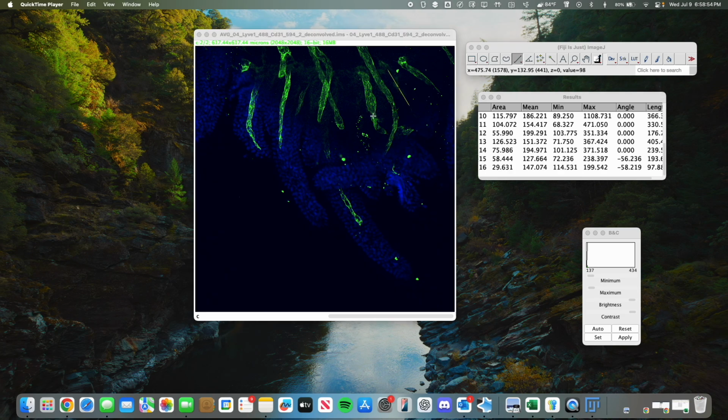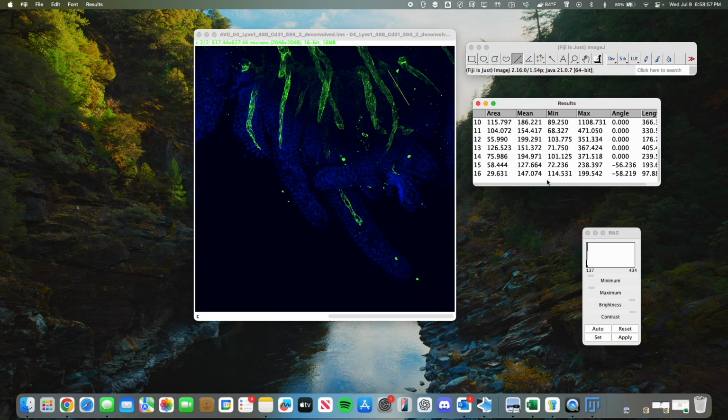We've completed quantifying the lacteals, and we have a list of all the measurements right here. As you can see, we have 16 that we got, so those are 8 villi that we can count. I excluded this last one over here as I couldn't see where that villus really leads to, and I wouldn't have a measurement for that value. So we have this set up.